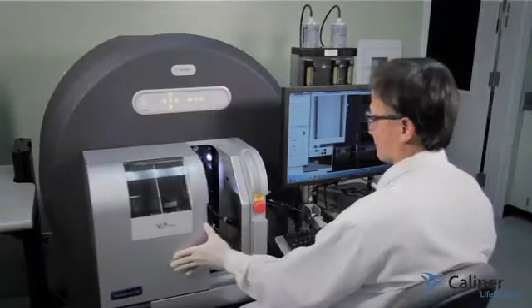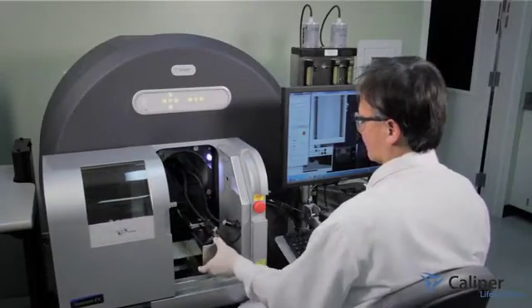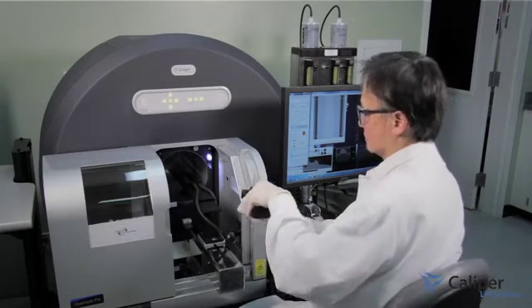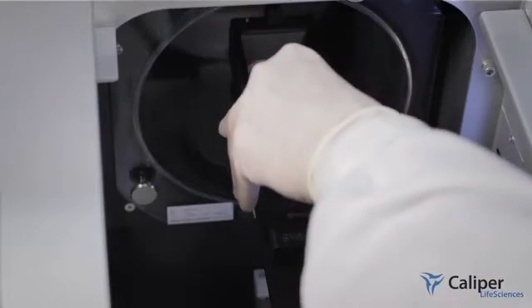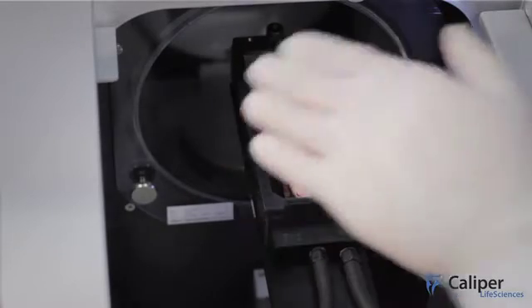The QuantumFX is the first standalone microCT to deliver high-quality images at an x-ray dose low enough to enable true longitudinal microCT in preclinical studies.